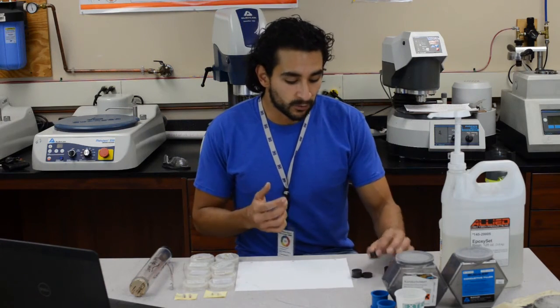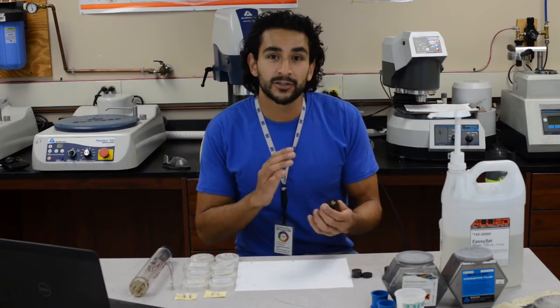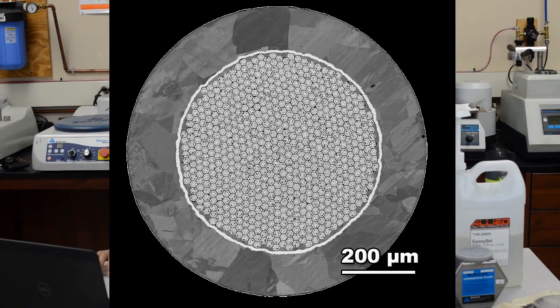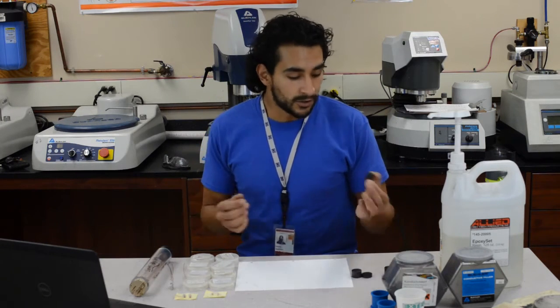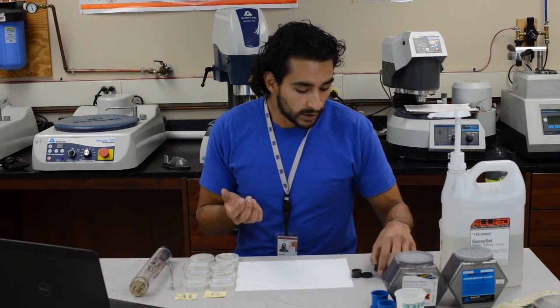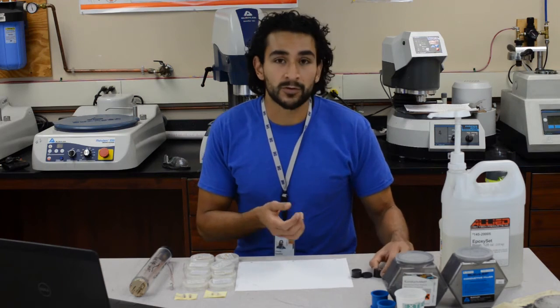So why would anybody want to do that? Well, most of the time, to take a picture of it so you can study its structure. For example, here is a picture of a superconducting wire that will be used in a fusion reactor. And other times, you may want to know what your sample is made of, in case you don't know. You can perform some X-ray diffraction, and by looking at the X-ray patterns, you can find out what your sample is made of.